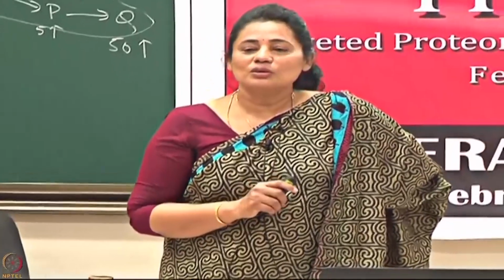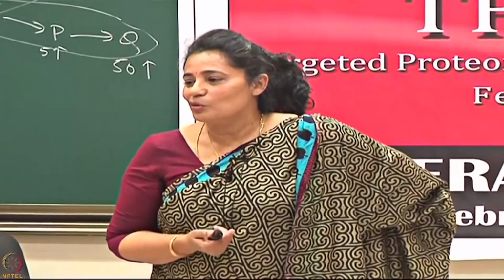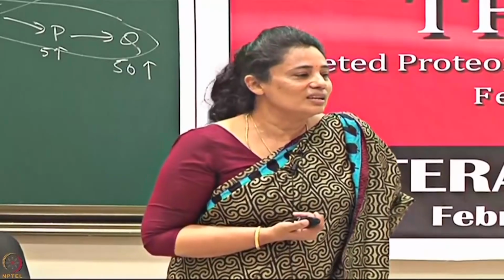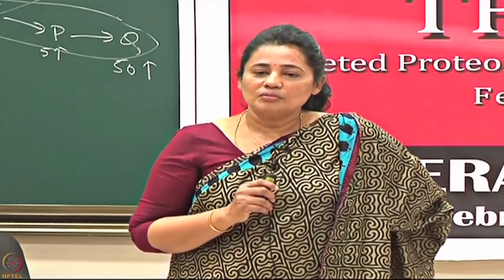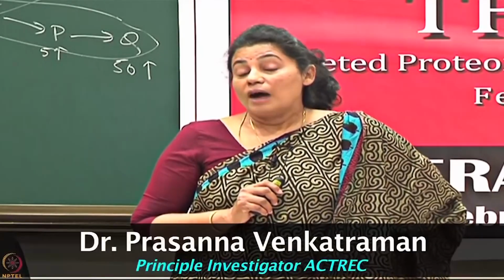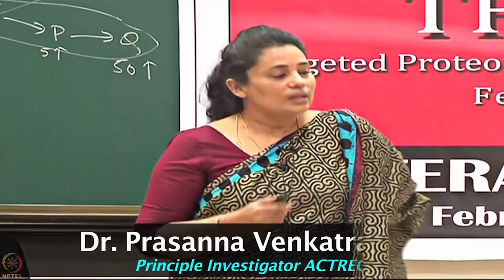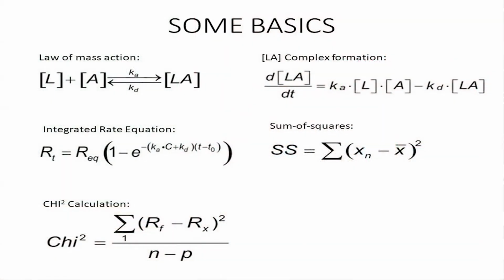Just because you did not do the experiment right, a second order fit or a third order fit might give you a very good fit, because now you are increasing the parameters to fit. So your sensograms will look nicely fitted, but that may be a wrong interpretation. Most often it is the first 1:1 binding that you should try. If after doing many experiments you think that things are not explained by 1:1 binding, then you begin to use other equations on this. So these are some things that definitely you have to look at.